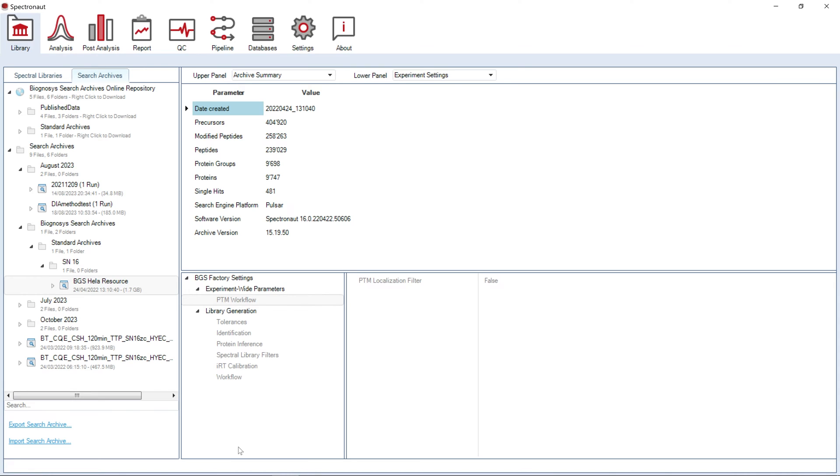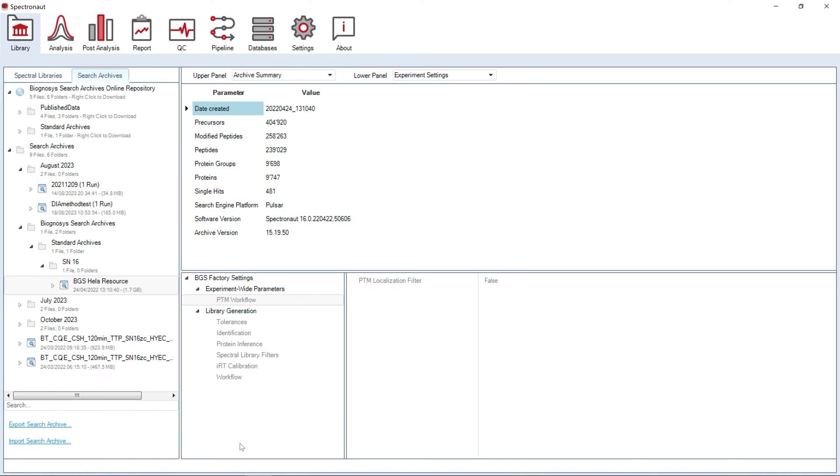This option can also be used to generate a new library exclusively from combined search archives. This can be very useful when you would like to generate a library from a bigger number of raw files. You can simply divide them into smaller batches, generate a spectral library for each, and subsequently merge the search archives in one common search space. Importantly, search archives are also generated during Direct DIA search, making Direct DIA an important and convenient resource for future search space generation.